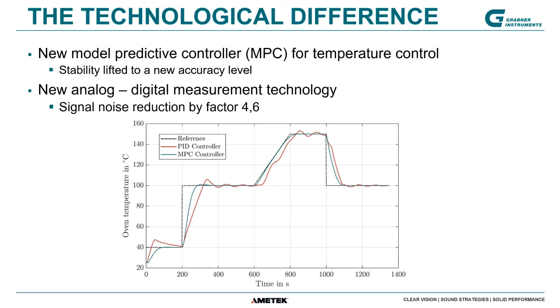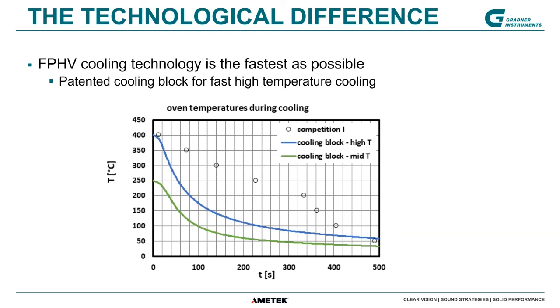Also, the latest technology has been used, which is making heat ramps much faster, as you can see here. And also the cooling follows a certain patent to make cooling and the cycle time of flashpoint testing much faster.